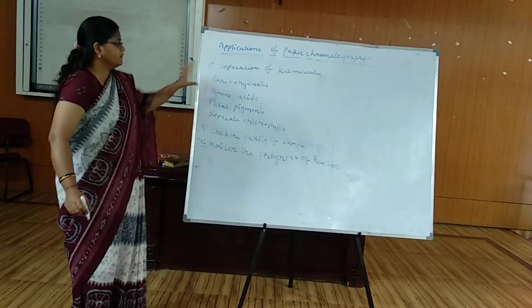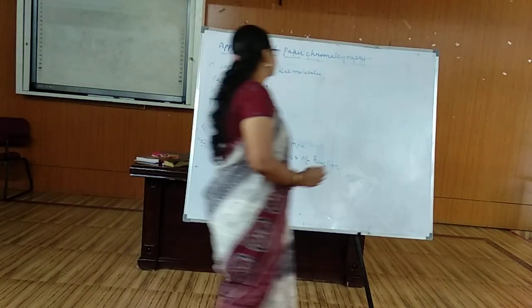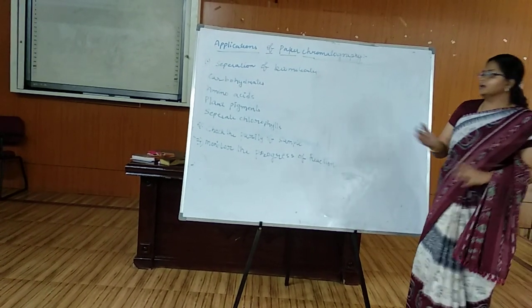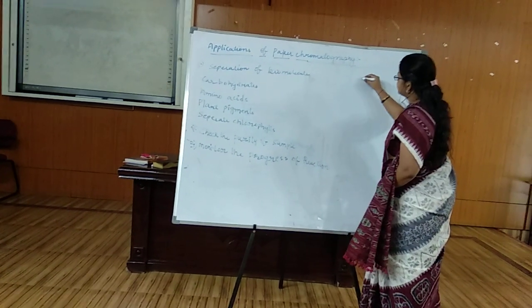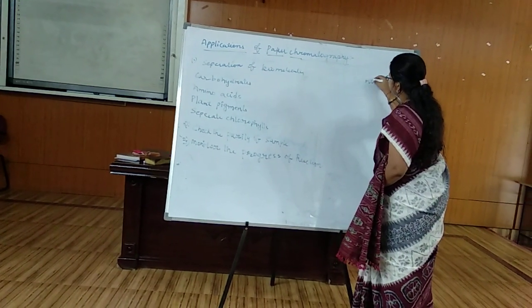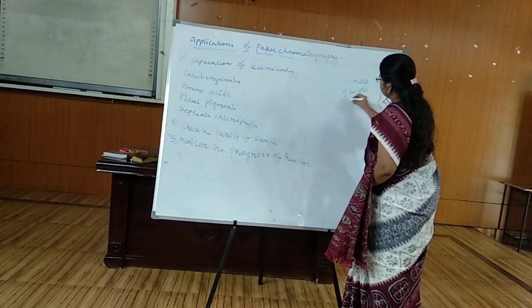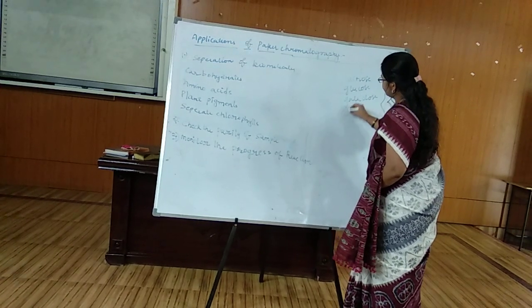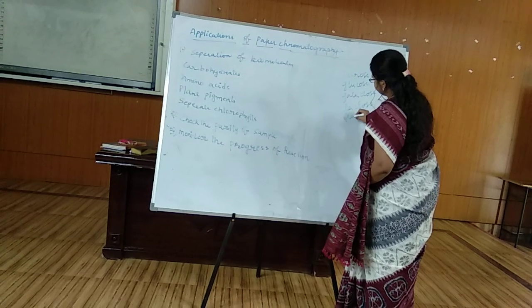So girls, now let us see the first application in detail. Suppose if you have a mixture of carbohydrates, simple sugars like sucrose, glucose, galactose, lactose, fructose.